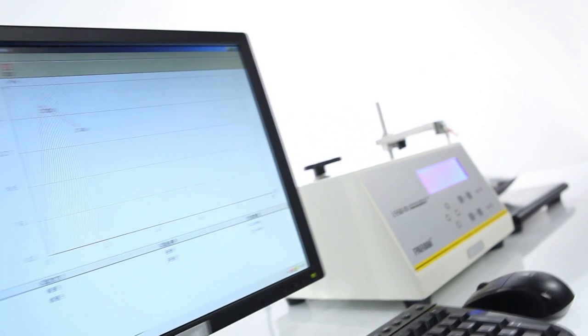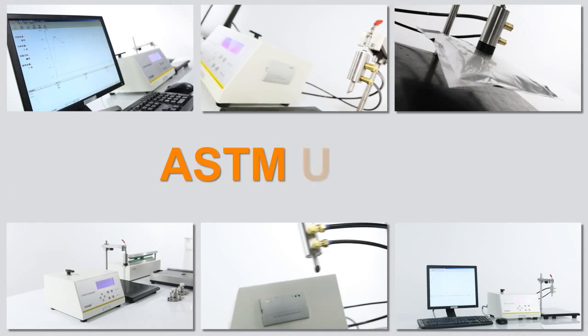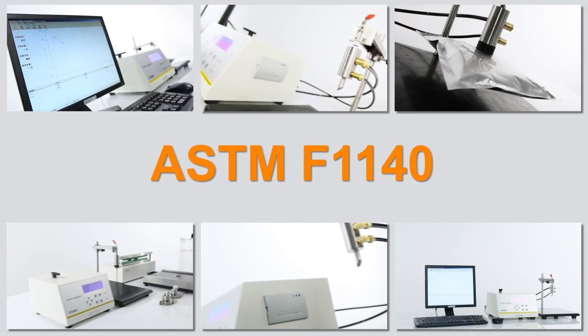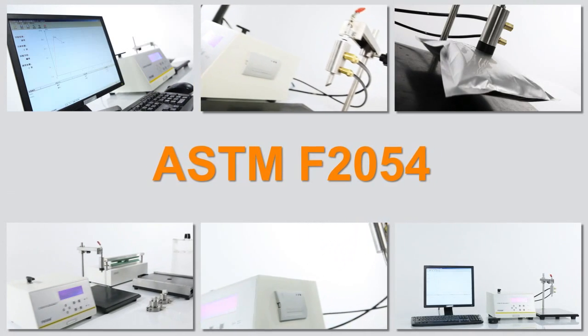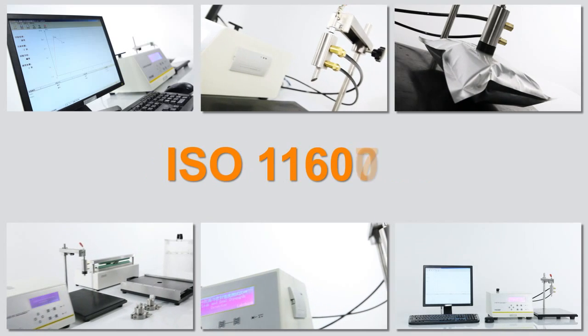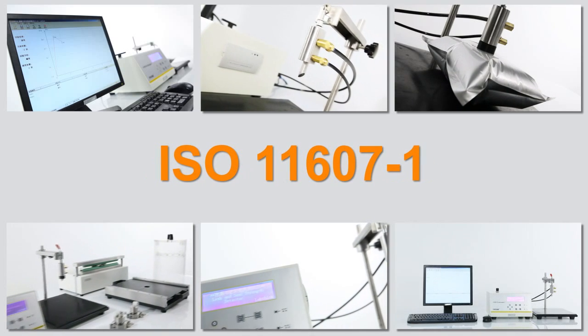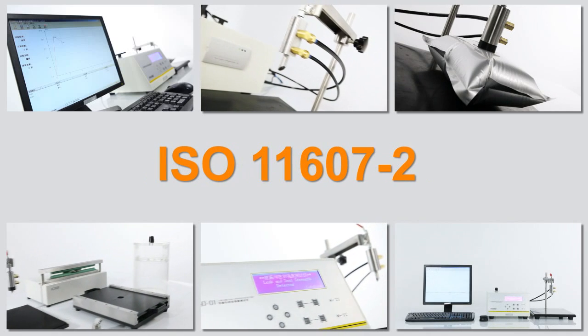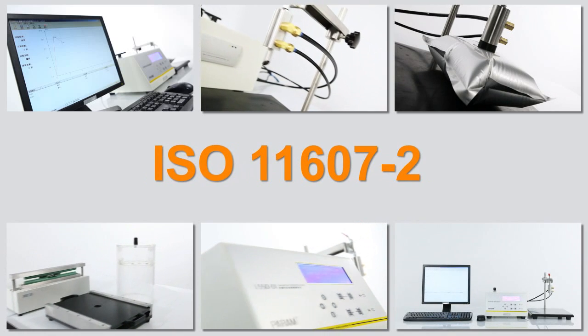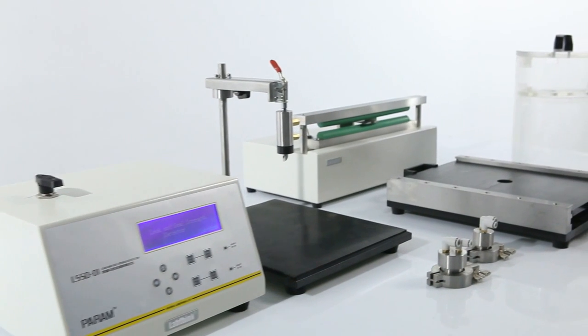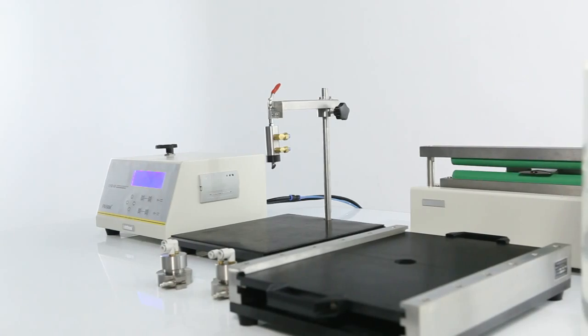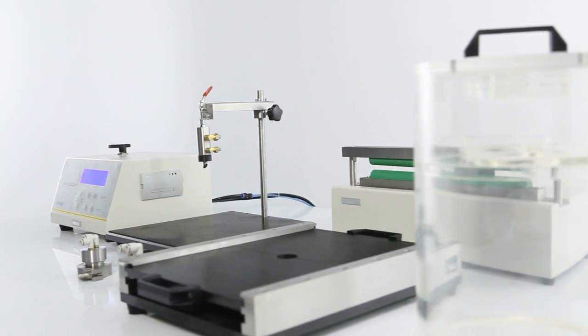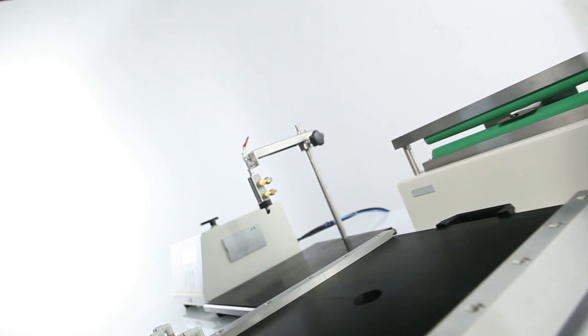The testing modes and principle comply with ASTM F1140, ASTM F2054, ISO 11607-1, ISO 11607-2, and other standards. With optional testing fixtures, this instrument can also accomplish tests of various types of packages and materials.